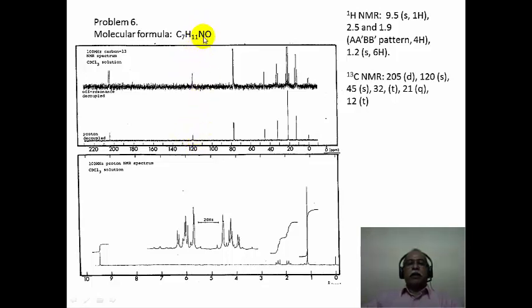The presence of nitrogen also seems to suggest that such a functional group is not unlikely in this particular molecule. Now this multiplet that is seen here is essentially because of the solvent CDCl3. It's appearing as 3 equally intense lines, which is a triplet kind of system, corresponding to the deuterium splitting of the carbon of the CDCl3.